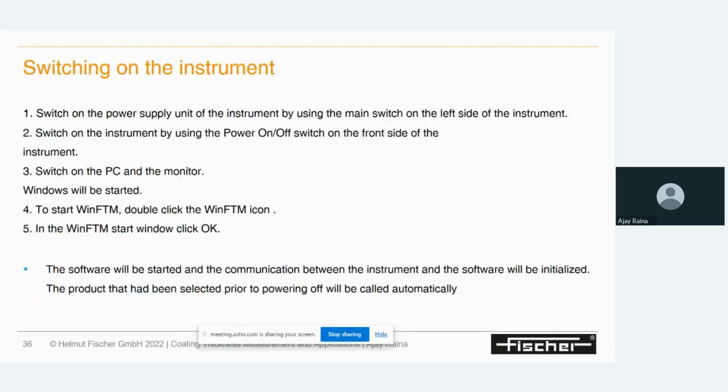This is the basic one where we just wanted to know how to switch on, basic training for switching on and switching off the instrument. If you are familiar with Fisher instruments, we provide a main switch on the left side of the instrument, and when you need to switch on the instrument, you can just press down the switch from the left side. Then in the front of the instrument, you can see the push button. So after switching on from the left side, you can power on from the front button, and the instrument will get on. After that, you can switch on the instrument PC, and the PC will get started.